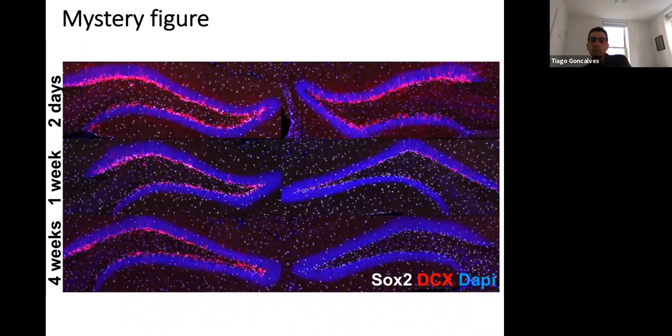Okay, another mystery figure. What is this? Any guesses? So I'll tell you, it's a dentate gyrus.